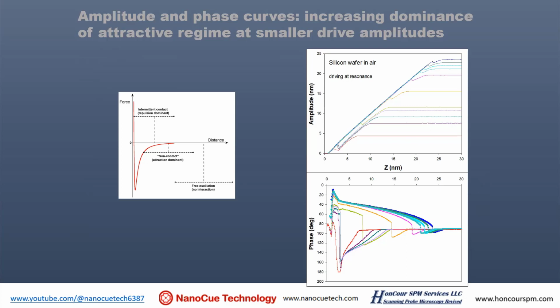If you oscillate the tip at lower amplitude, you can manipulate your set point over a long range and it's always attractive force. And if you change your drive to a high amplitude of oscillation, and then play a little bit with the set point, it immediately turns repulsive. And this is understandable.